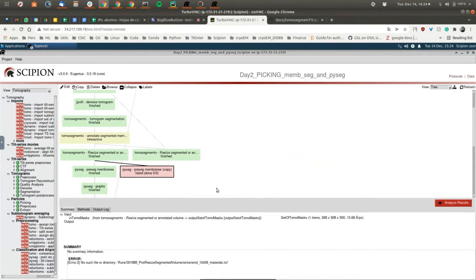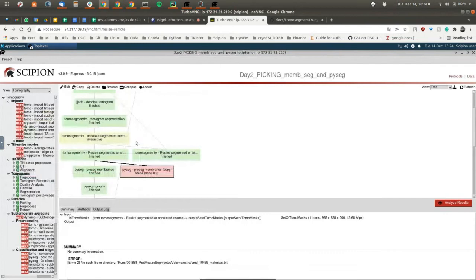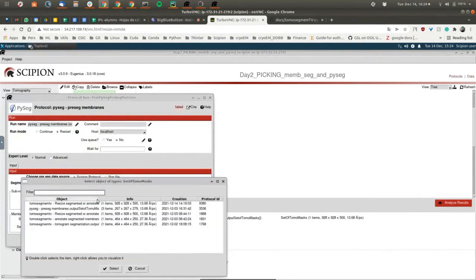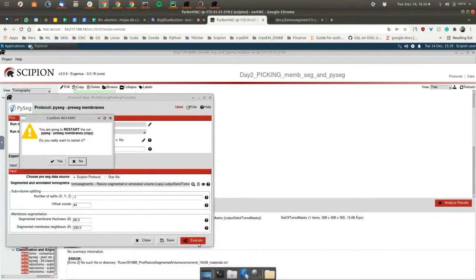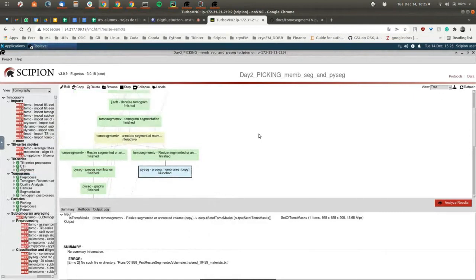Yeah, it looks exactly like it looks on your screen. Maybe it was missed during the migration. Let me point to the one I've copied before. The output set of tomo masks? Yeah, it's working fine. Maybe there was something generated meanwhile that was not migrated.